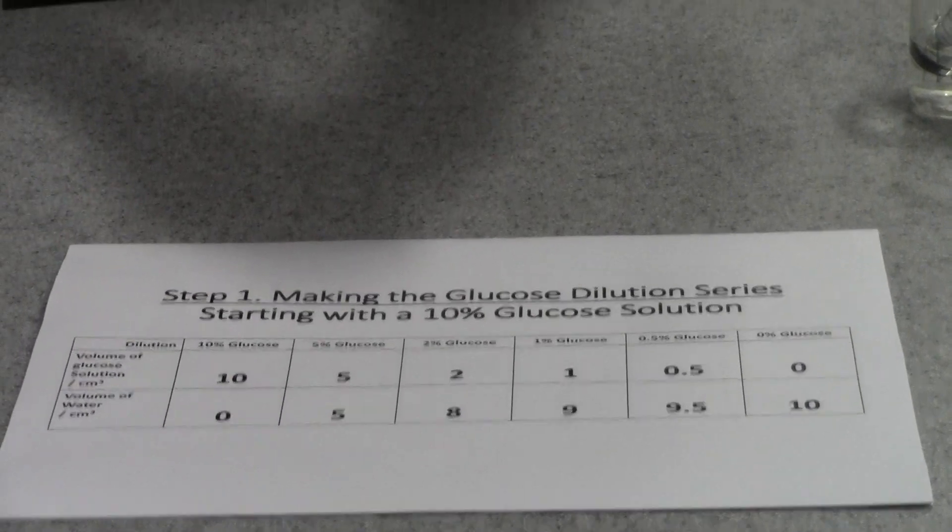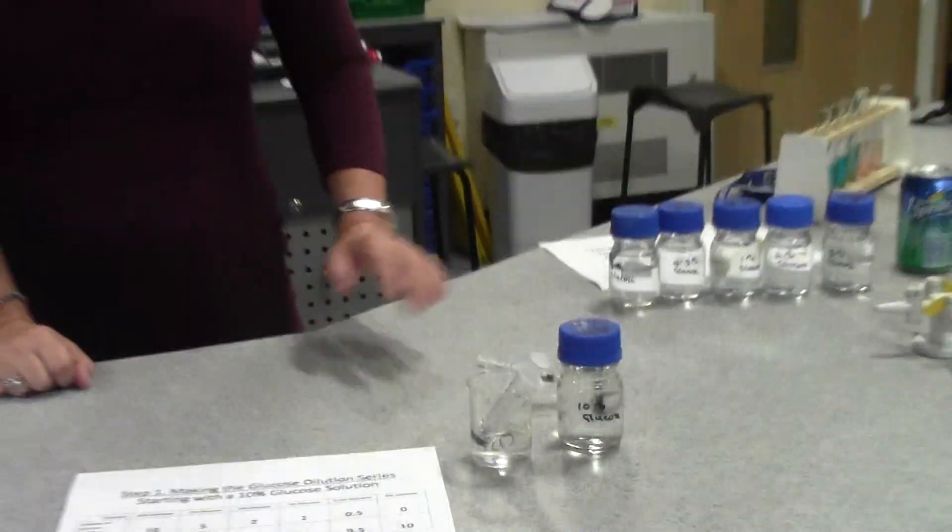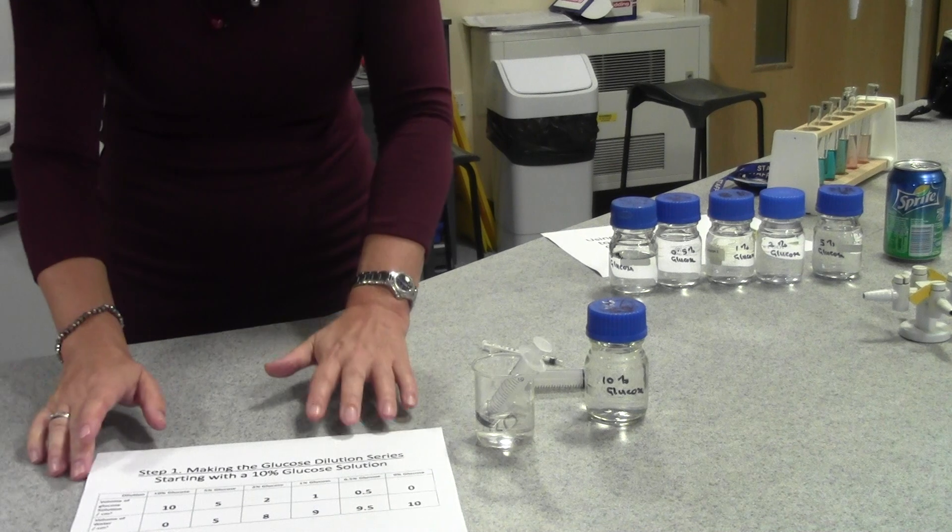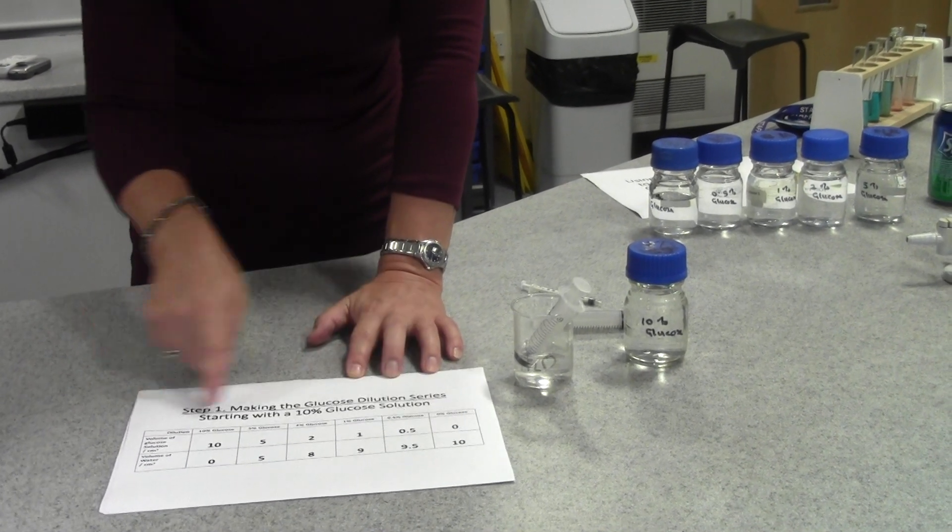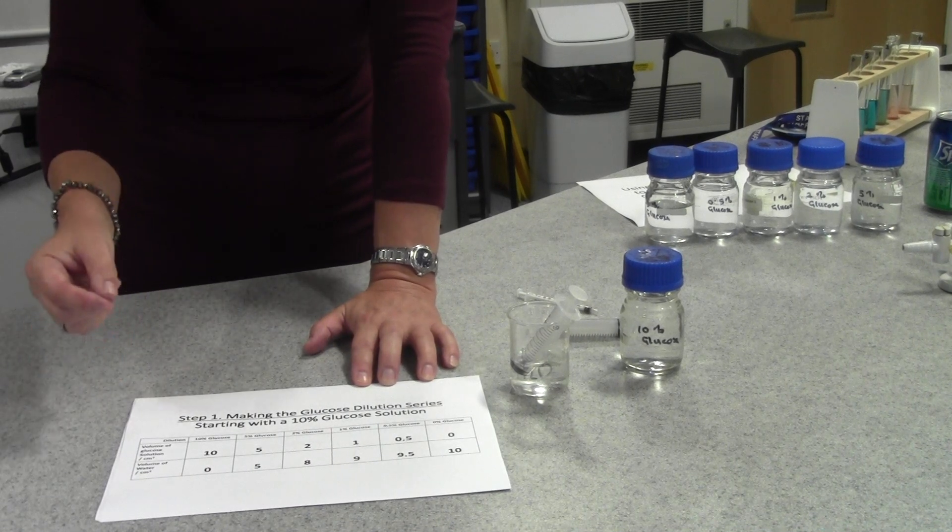To do this, the technician has provided 10% glucose solution and you'll need distilled water and a couple of different syringes. If you've got 10% glucose solution to start with, it's quite easy to make a range of dilutions, and the table here shows you the different volumes you'll need to make 10 centimeters cubed.